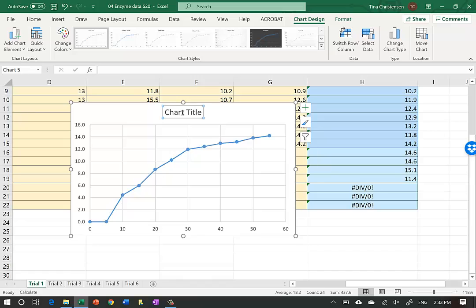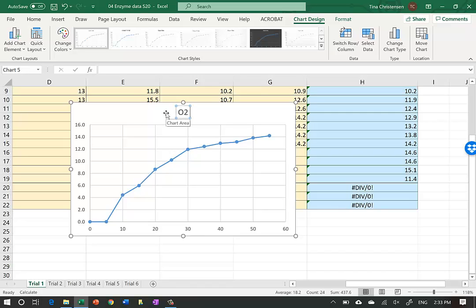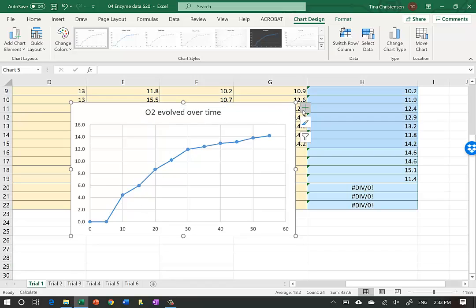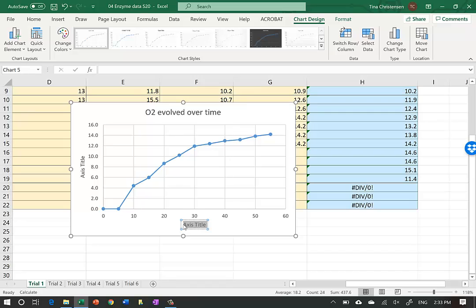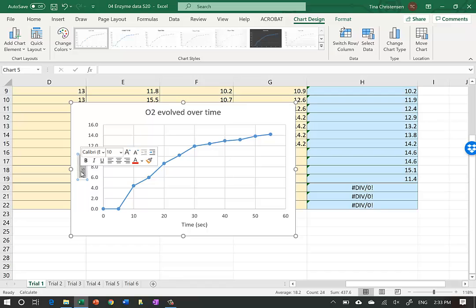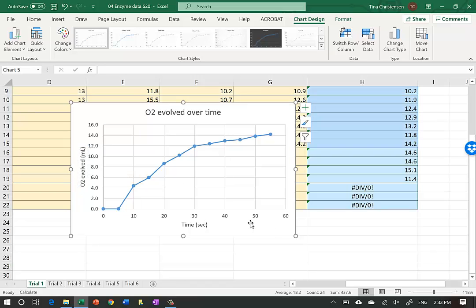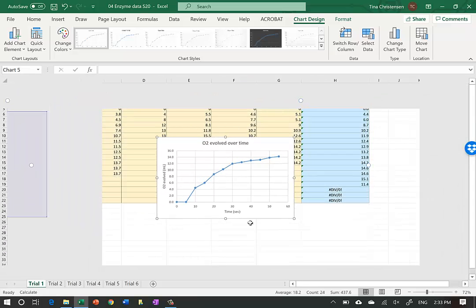We want to add a title, so we highlight that and type 'O2 Oxygen Evolved Over Time.' We also want to put axis titles. The x-axis will be 'Time' with units in seconds in parentheses. The y-axis will be 'O2 Evolved' with units of milliliters.